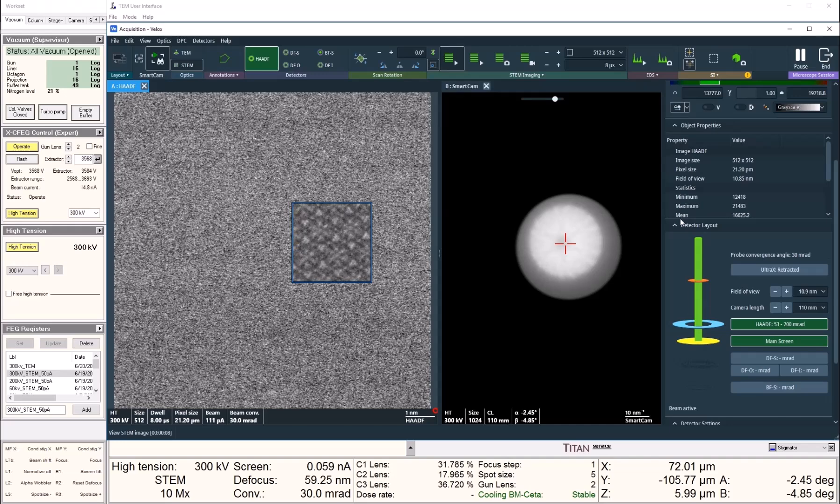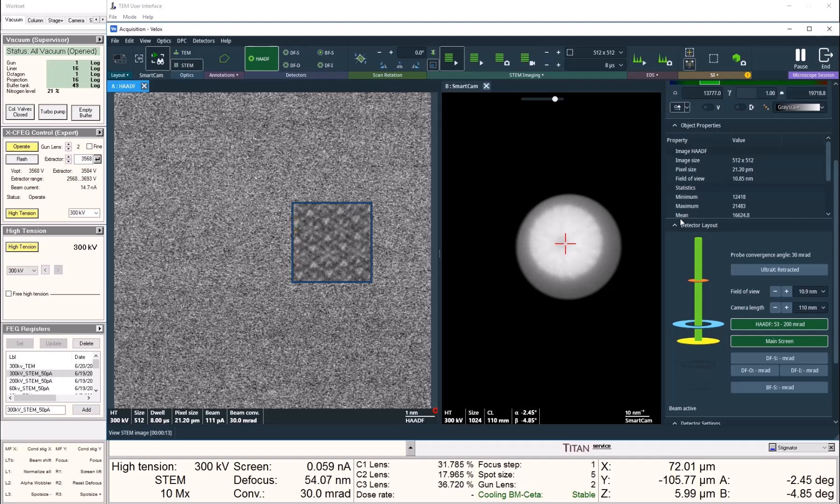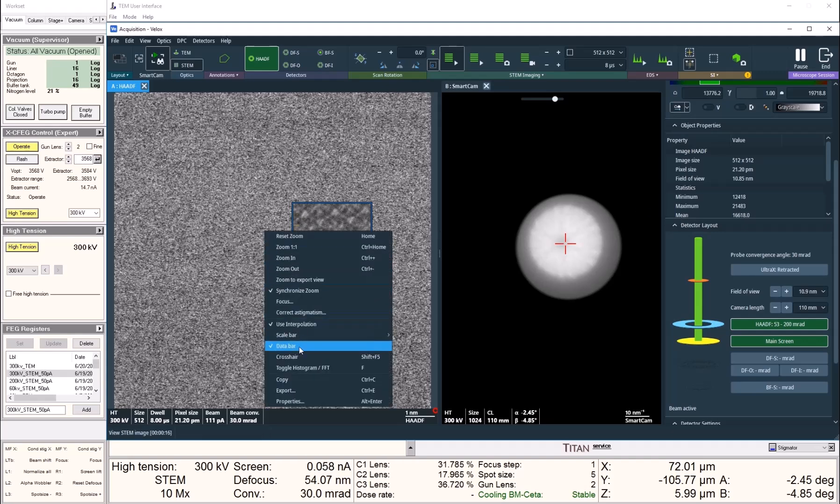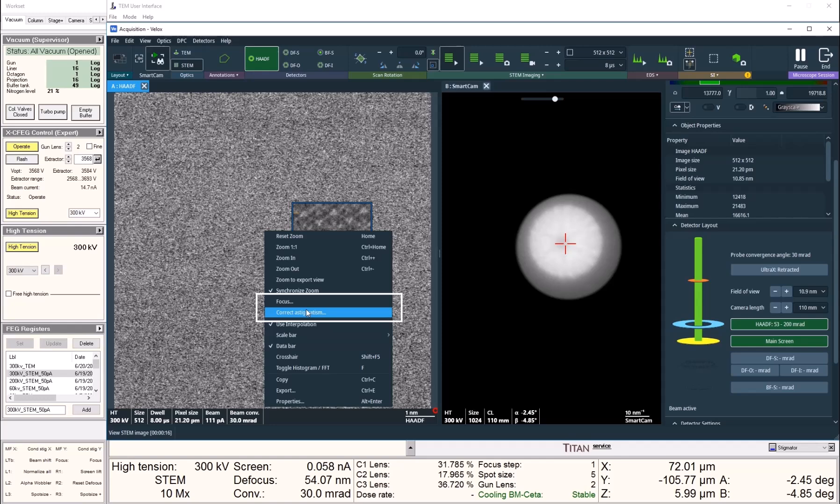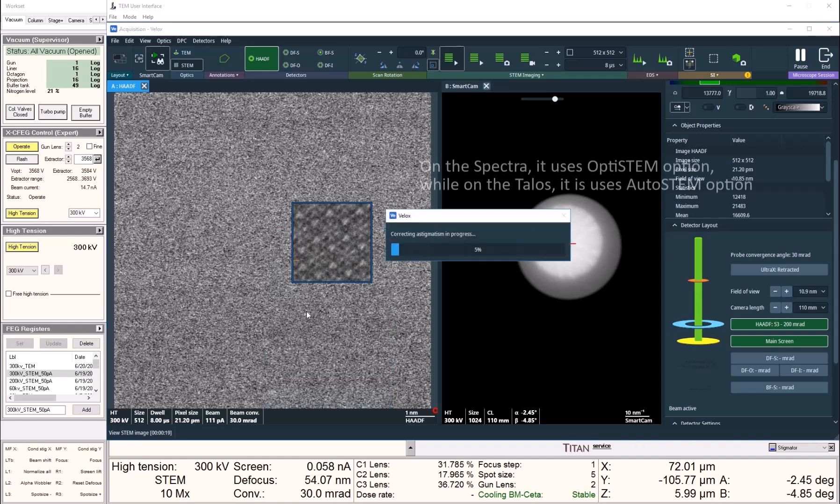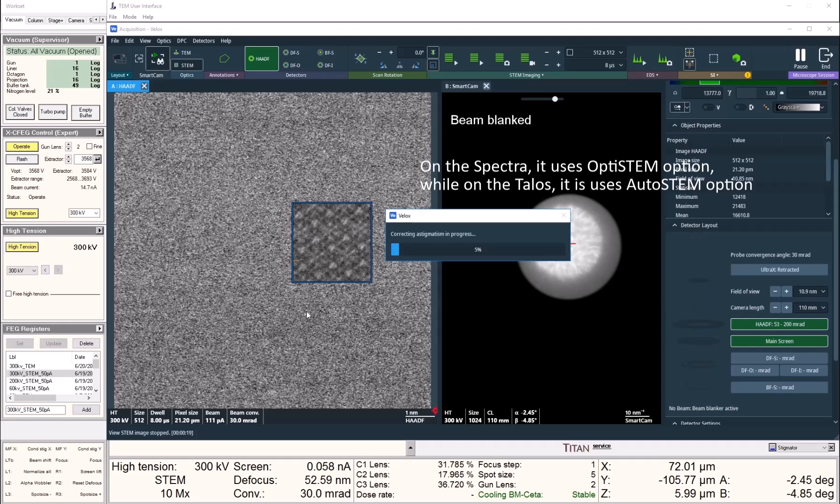As I wobble through focus, I can see clear signs of astigmatism. Now instead of me trying to manually tune the astigmatism, I can right-click on the image and find the two buttons for the OptiStamp function: focus and correct astigmatism. Now I can click the button for correcting astigmatism, and VLOG software will execute this function.